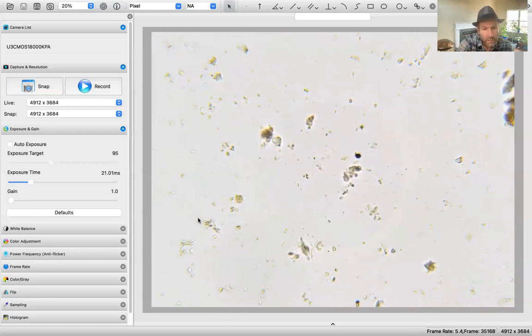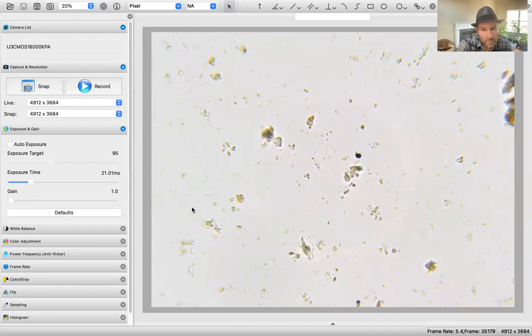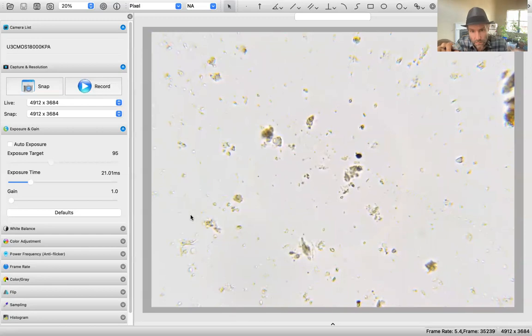That's possibly a cercozoa, but we're gonna go with a cyst. Maybe a cyst or a ciliate or a flagellate cyst. It looks like it's one of the ones that's right in the middle of the size differences. All right. Nope, nothing to count.